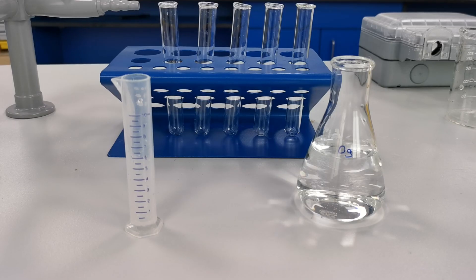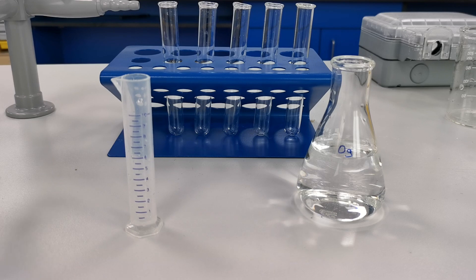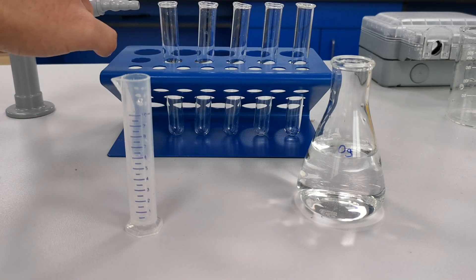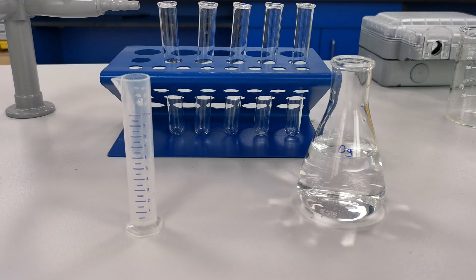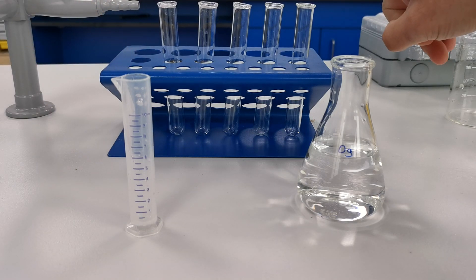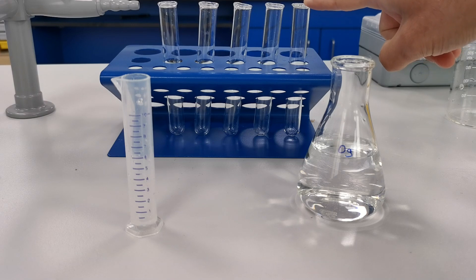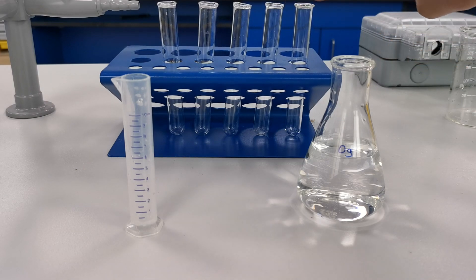Next I'm going to measure ten centimeters cubed of each sucrose solution and pour them into the five test tubes. I'm going to put the least concentrated solution into the left test tube and then gradually increase the concentration until we get to the most concentration in the right test tube. If it helps, you can label them.